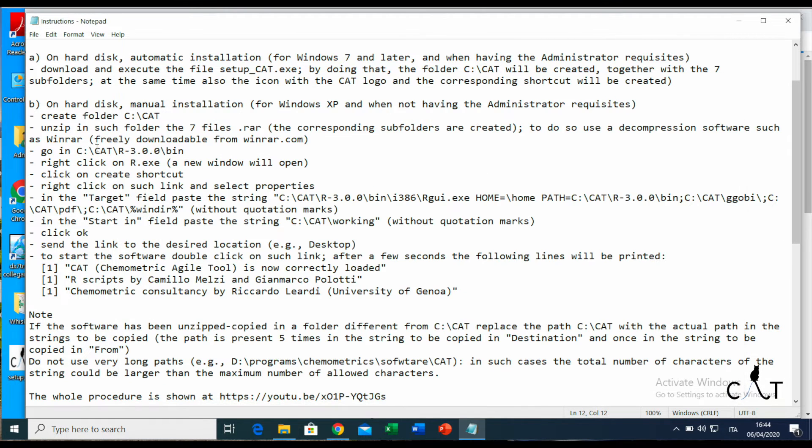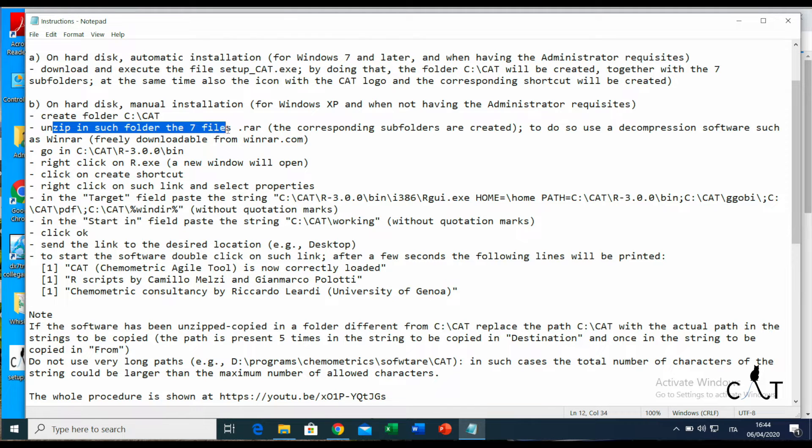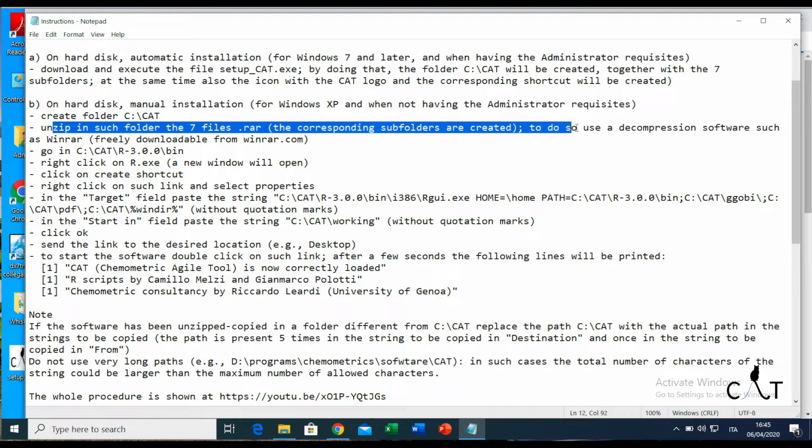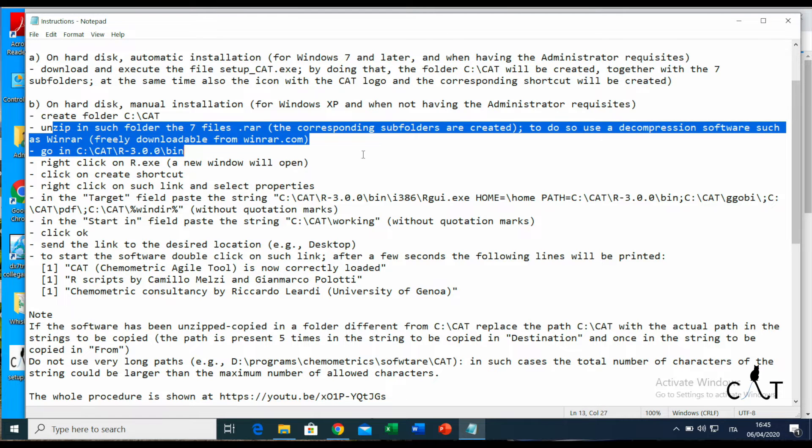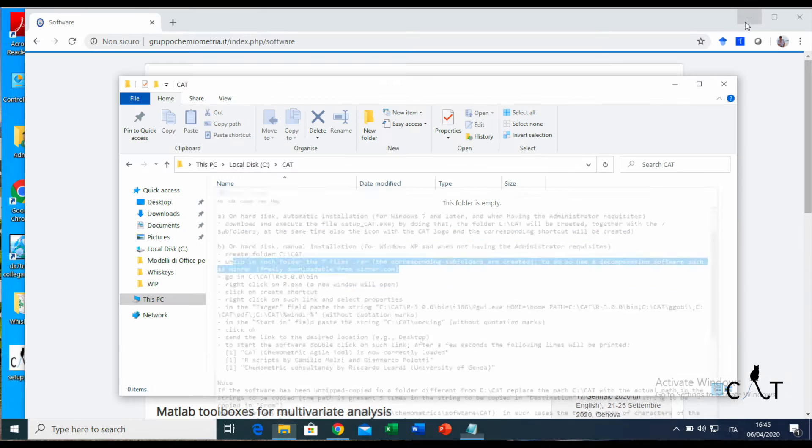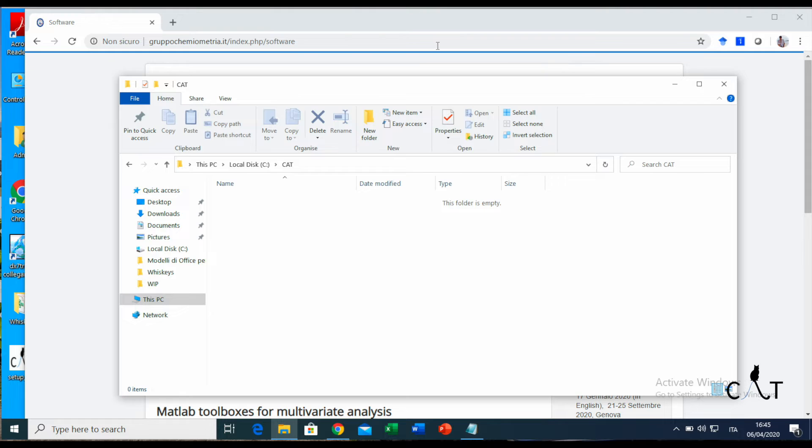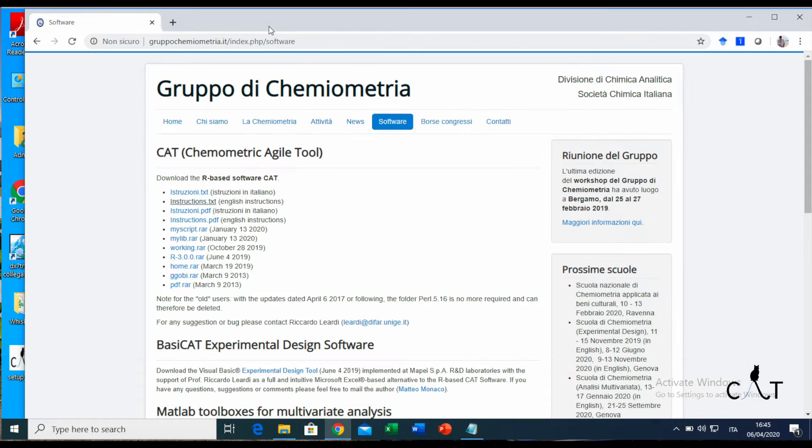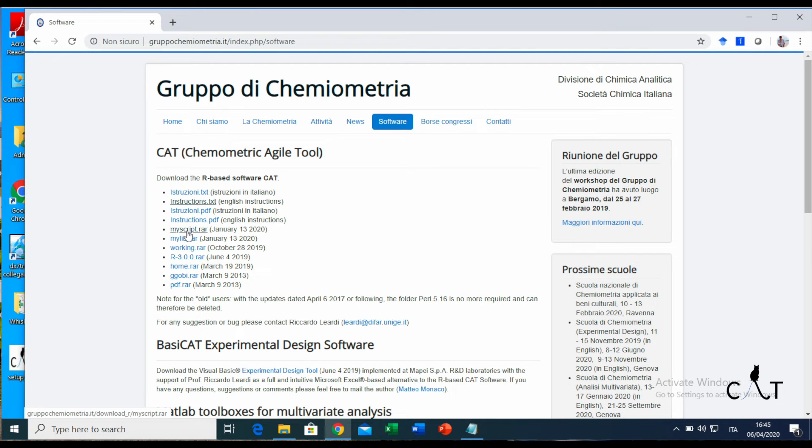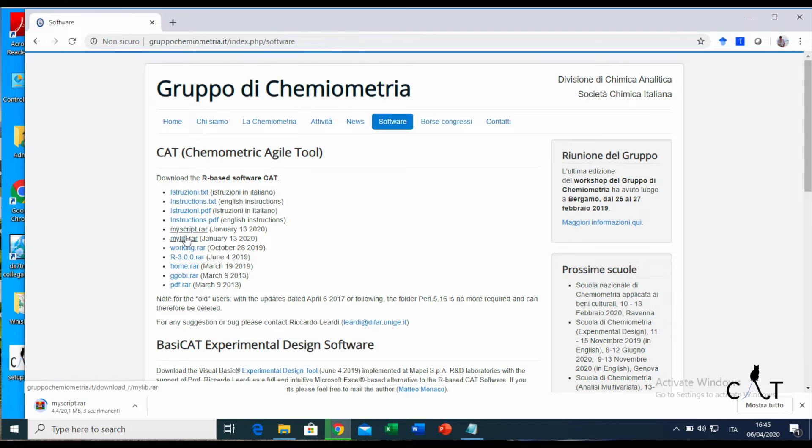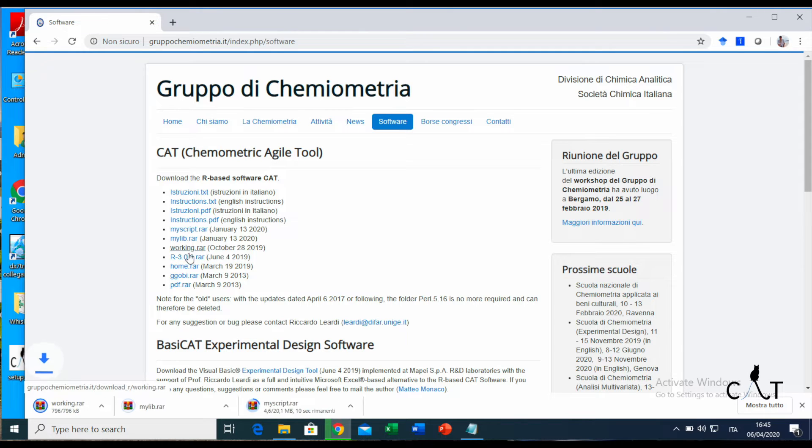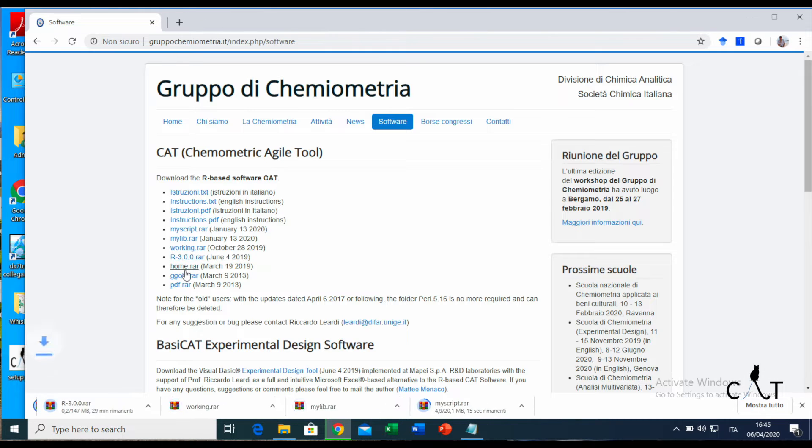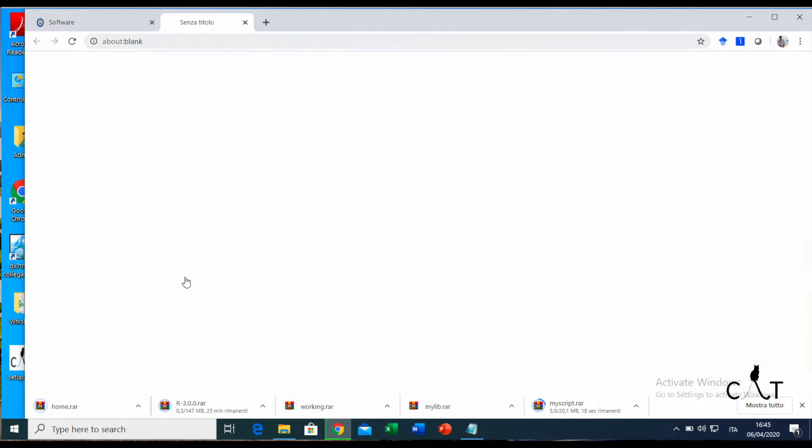Here we are. We want to unzip in such a folder the seven files. So we're going to go and find those seven files. Here we are. Each one of them, we need to double-click to download. It's just a matter of patience.